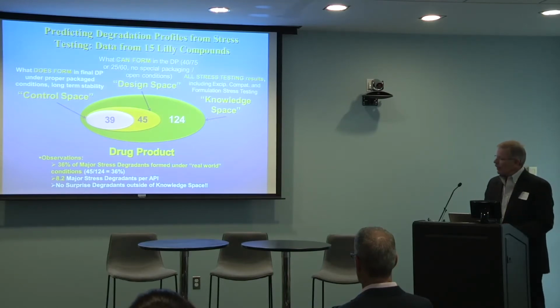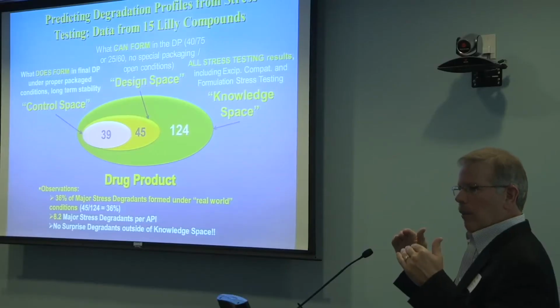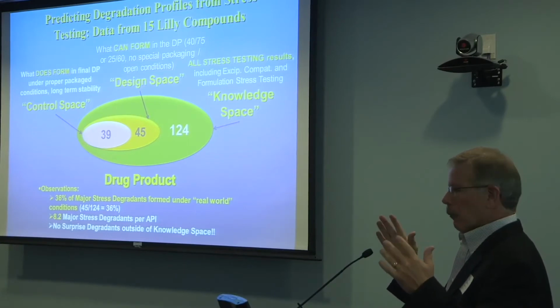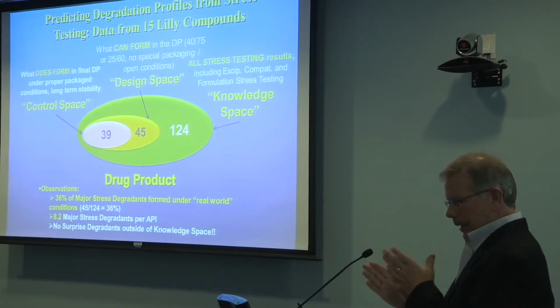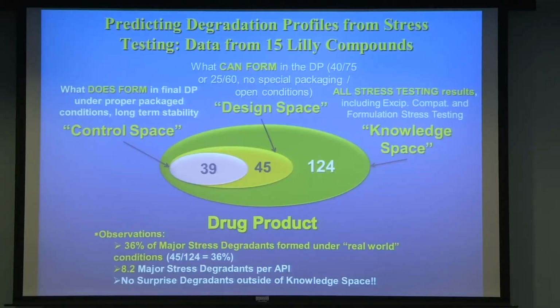So we might not have had 39 had we not known there were 45. By that I mean they're below maybe what we would have identified, but now that we know that peak was there, we can say, oh yeah, at 0.06% there's that peak, at 0.03% there's that peak. It gives you an idea that that kind of stress procedure is pretty good. Now, I'm not trying to claim that it always is inclusive of everything like this was.